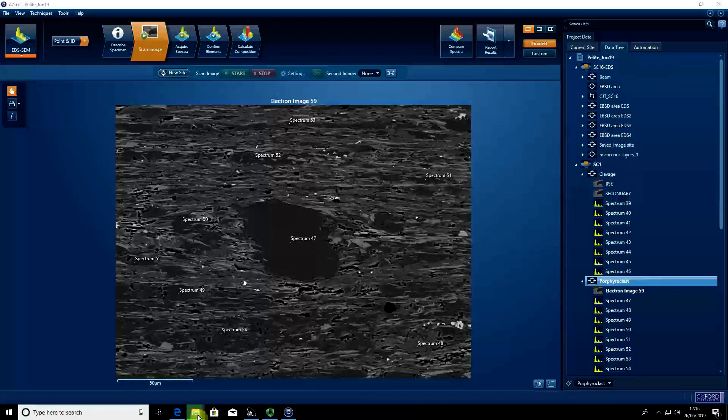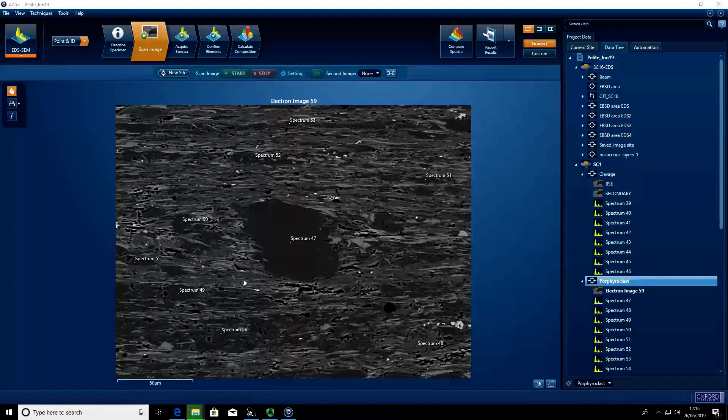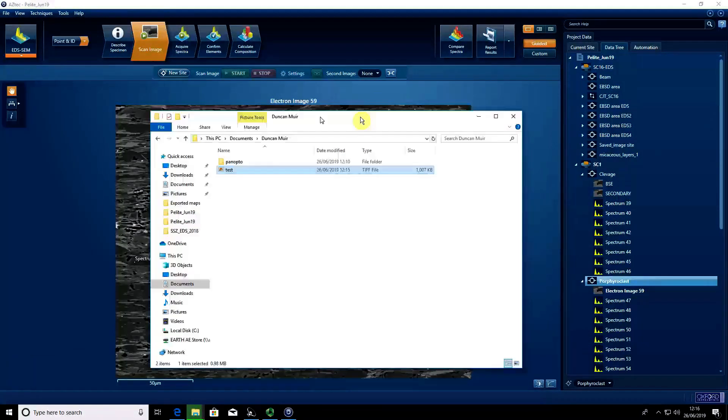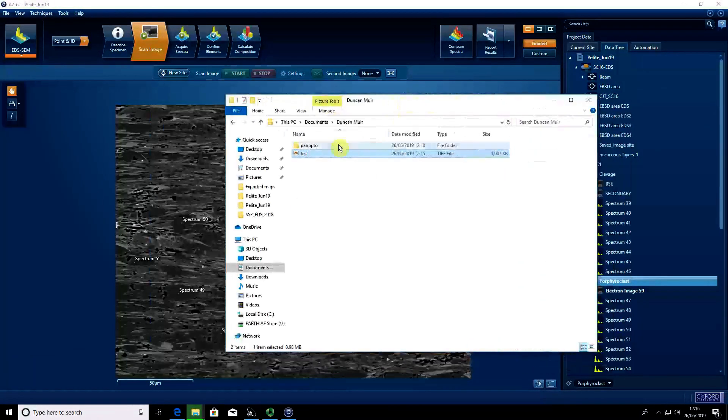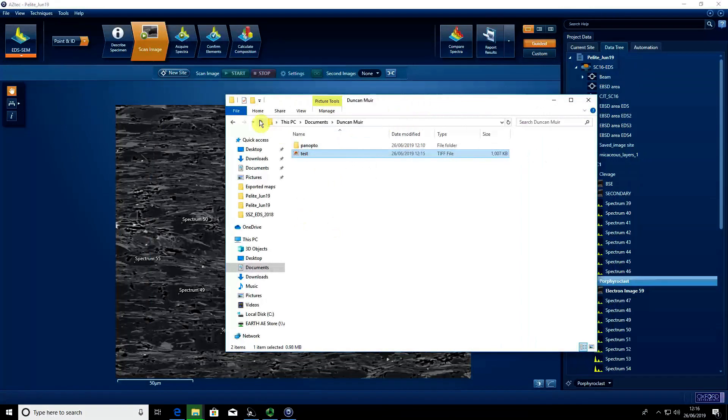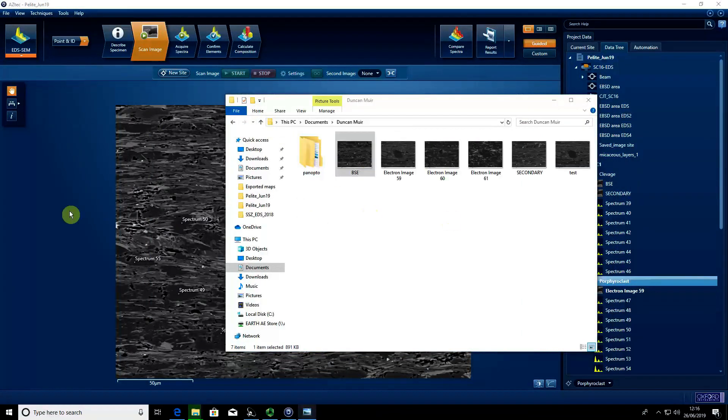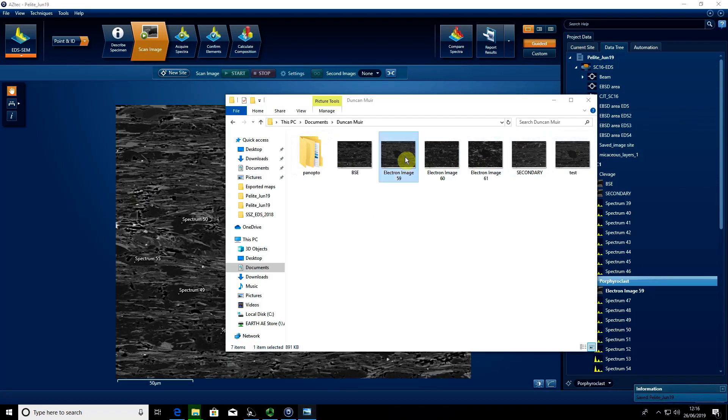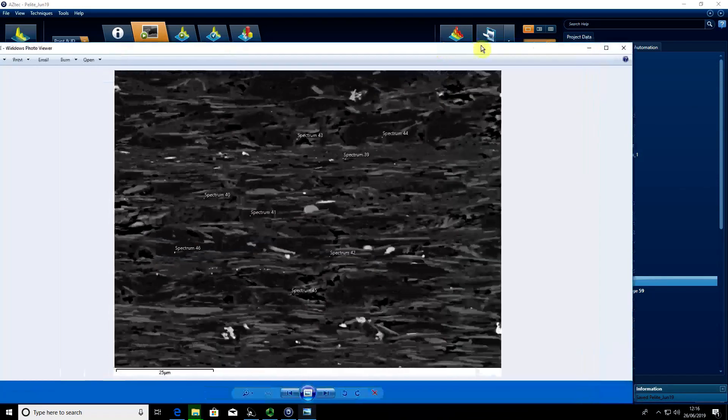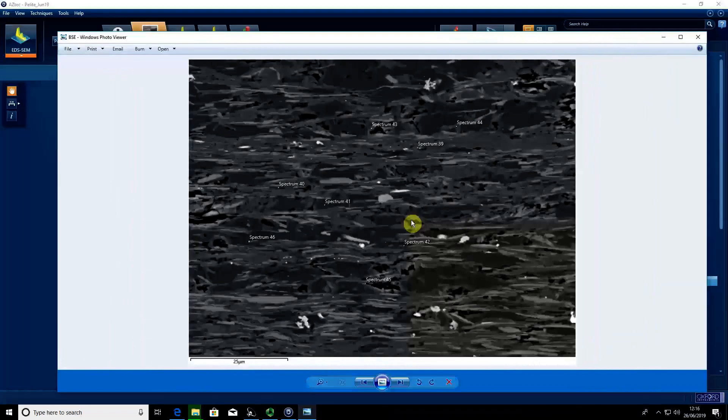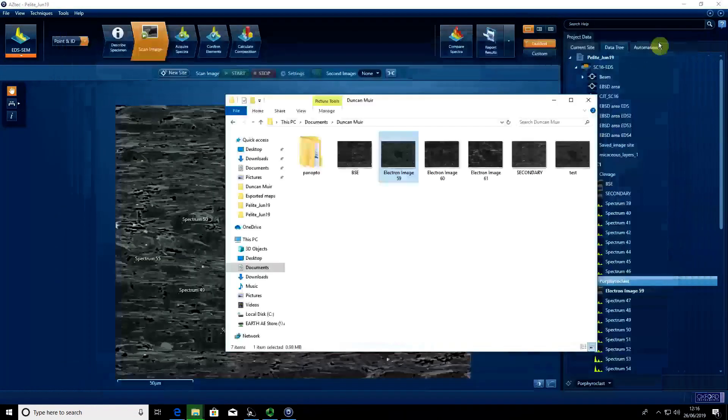If we go to Windows Explorer, we can see that we now have various images, each of which has a spectrum location on.